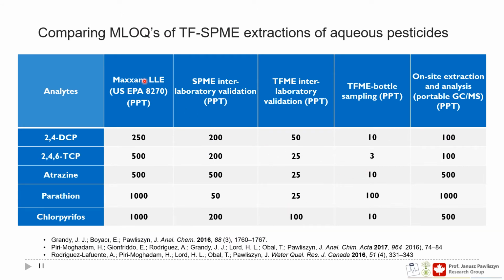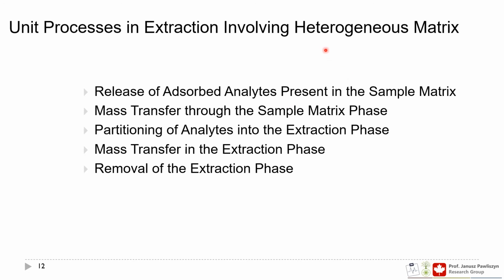So if you have a standard water analysis system performed by the commercial lab, Maxxam Analytics, versus the thin film microextraction in bottle approach, as you can see, it's as what we said, close to 50 times lower method limits of quantification. So this is a very good opportunity to green up the way of water analysis, which is done in larger amounts.